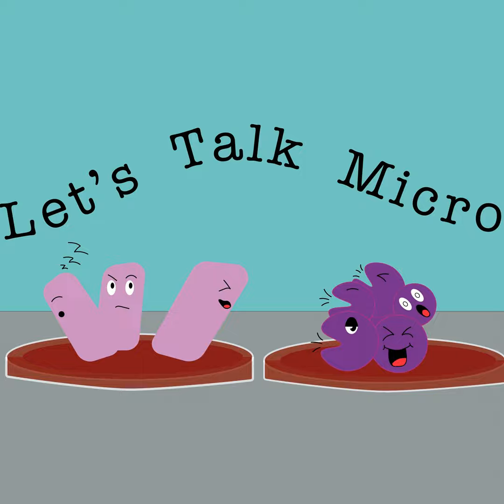And today's episode is also an interview episode, and it is about teaching microbiology remotely. So it is about an article titled Teaching Microscopy Remotely, Two Engaging Options, and two guests joined the podcast. They are two educators, two college professors. One is Kathryn Lionetti, and the other one is Heather Townsend. And they talk about the approaches that they use to teach microscopy remotely. One of them involved students taking microscopes home, and the other approach involved students using a program called Scope from the University of Toledo, where they have access to an electron microscope.